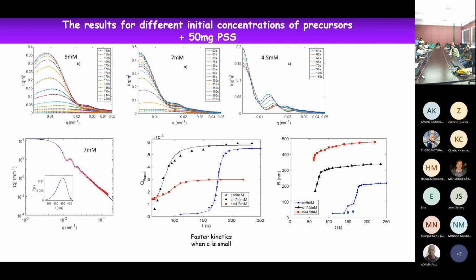So typically when you see that, at the beginning they are very small. In this case, you have small particles and big particles which are starting to form, and very quickly you form the clusters of calcium carbonate. Okay. In this case, we were not able to look at the start of the experiments, because when you mix the solution, you have to close the door of the hatch where you do the experiment, and start the experiment from the computer. It takes about 60 seconds. So we could not do experiments below 60 seconds in this case.